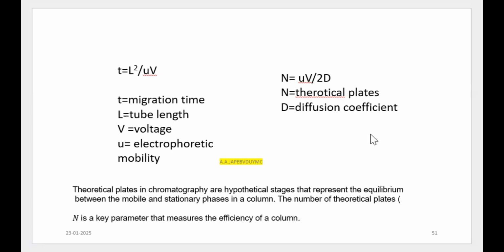So diffusion constant D also, which is dictated by the solute, cannot be much manipulated, but under applied electric current it is going to be moving, and diffusion again is going to be controlled only by one factor, that is the high voltage that you are applying, right?